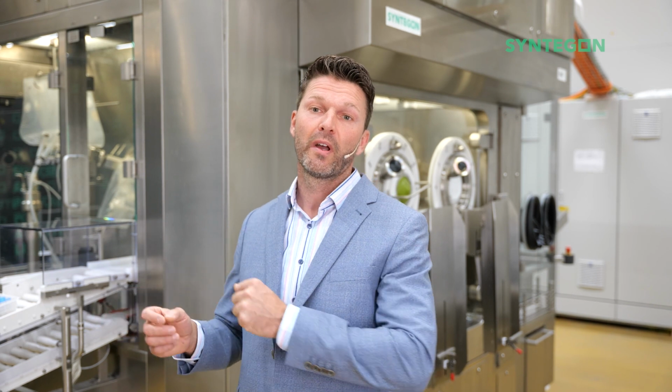No additional devices are needed in the technical floor above the work cell. That means the supply air is taken from the room and exhausted back to the room with appropriate filtration levels. In order to have proper conditions of the air and its flows, ventilation fans as well as a cooling unit are integrated into the plenum. Catalytic converters in the recirculation air ducts are used to minimize the duration of the biodec cycle by aerating with 100% fresh air. Also, the biodecontamination system is completely integrated into the process chamber, respectively into the isolator plenum.